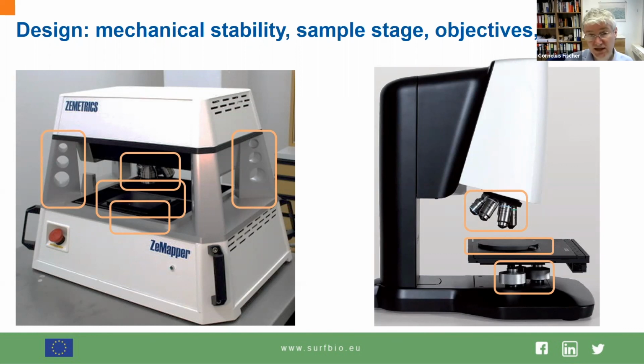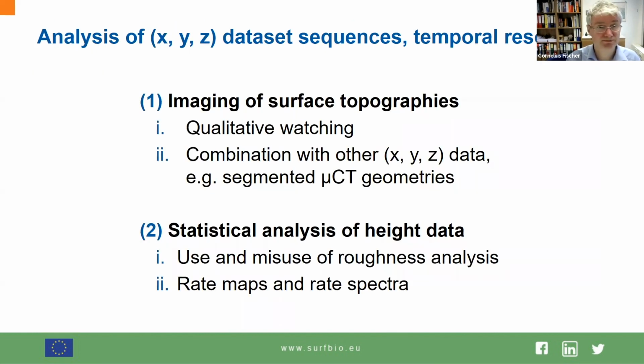You know, we get XYZ data, that's for sure. Nevertheless, we're observing things perpendicular to the sample surface. So it's rather a 2.5 dimensional data set than a 3-dimensional data set. We'll come back to this point.